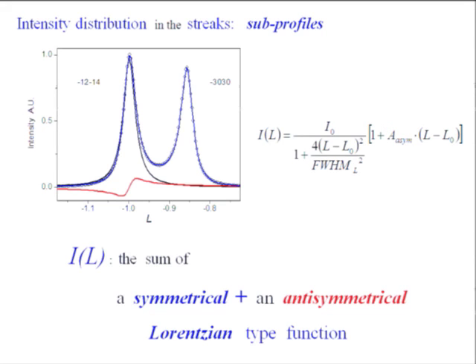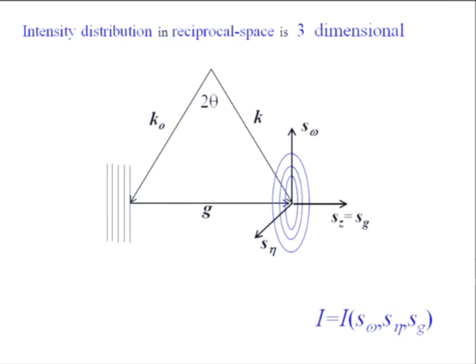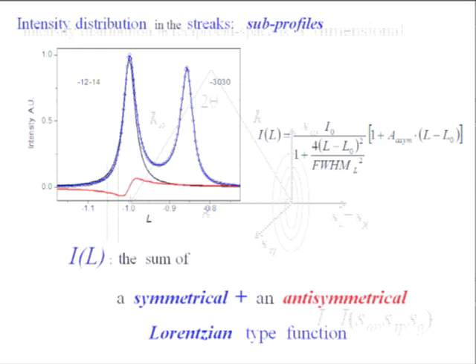L is always indicating that it is not yet a line profile. Now the next step will be to produce line profiles. Perhaps one more important point: in this representation, in the triclinic system, the profile functions are identical. They have no HKL dependence apart from the asymmetry.